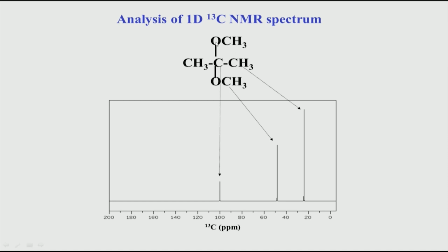So, the idea is to quickly capture the chemical shifts without waiting too long, but if you do not wait sufficiently long, the intensity is reduced because of the incomplete T1 relaxation. And that is why the peak intensity of these quaternary carbons is usually very weak. We will also see this in the case of aromatic systems, aromatic quaternary carbons.